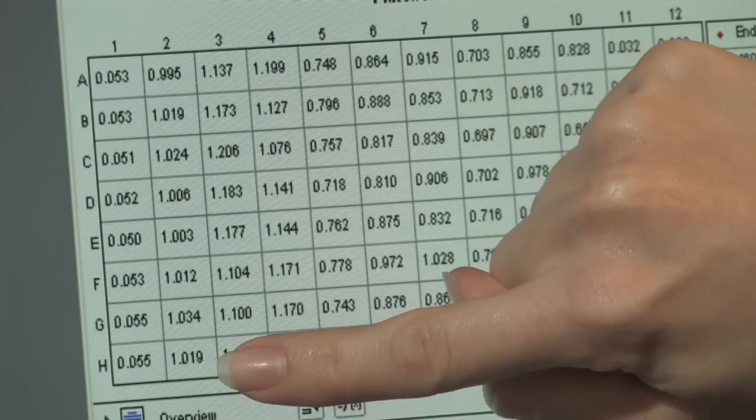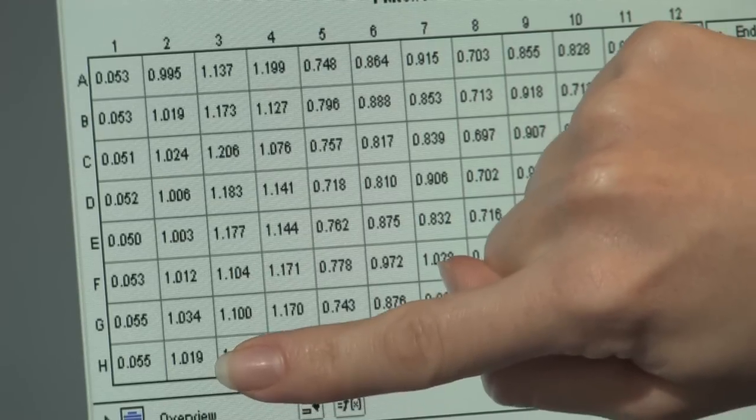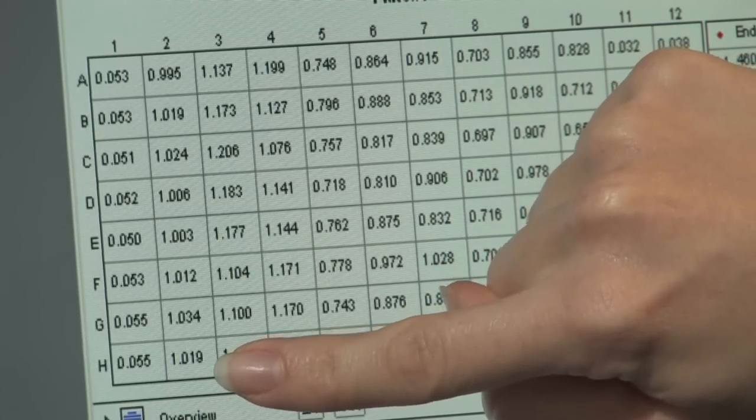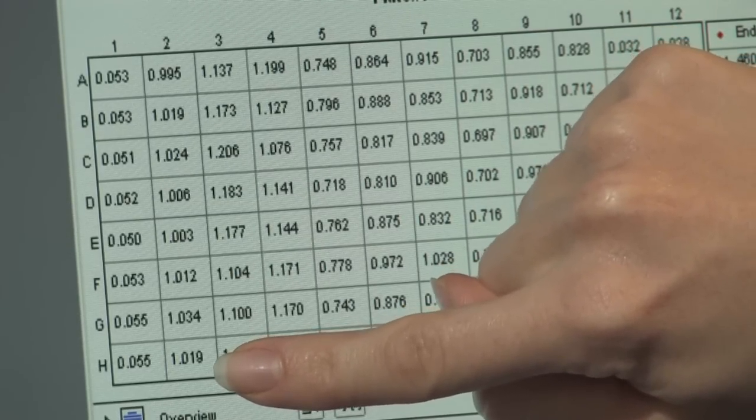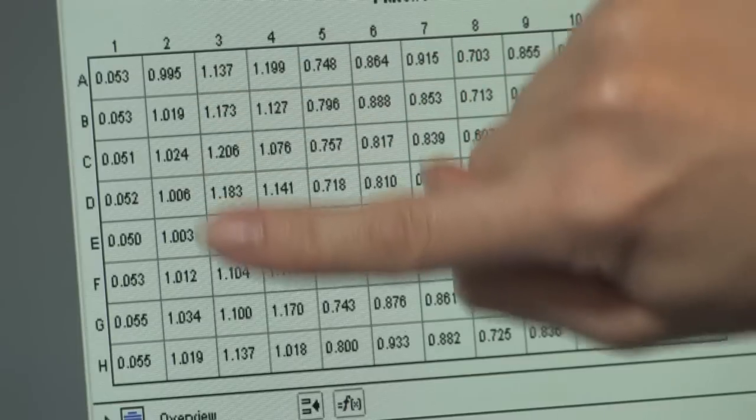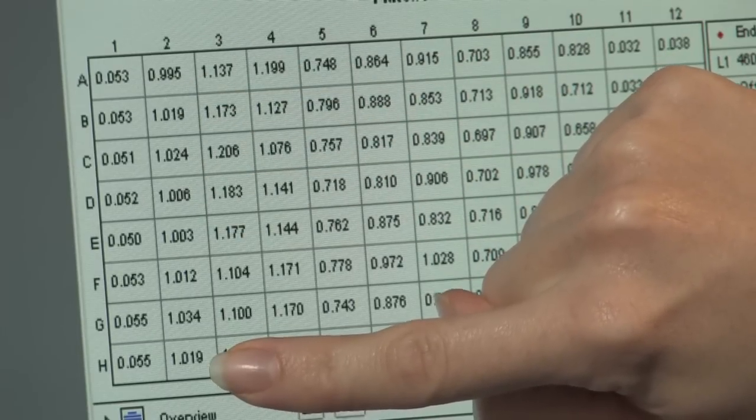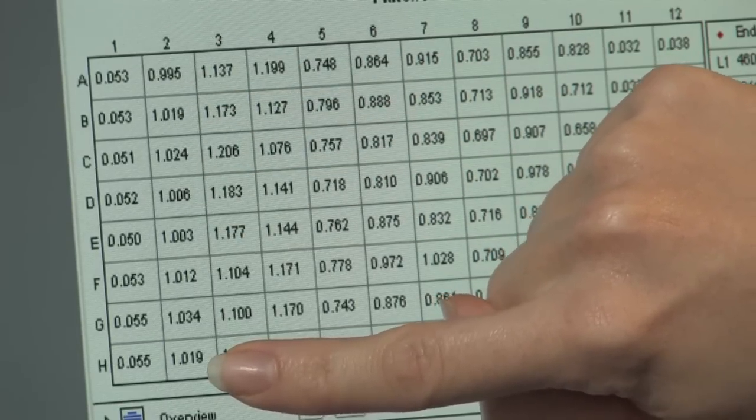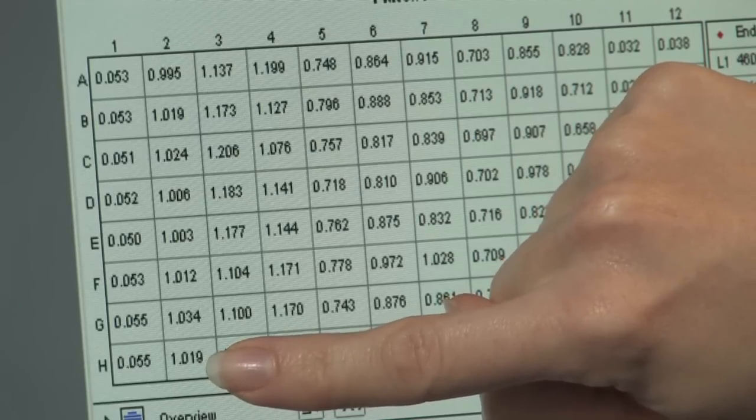In the next row, we have just soil with the buffer. So this is again a negative control. And there is a bit more color than the DOPA. So we're at about one for all of these, for this entire row. So we did have color with our soil. So this is okay.